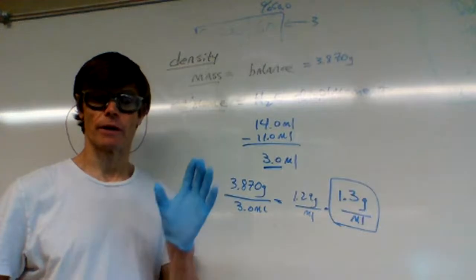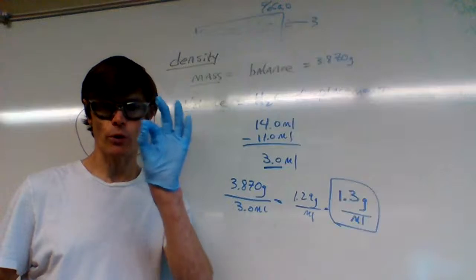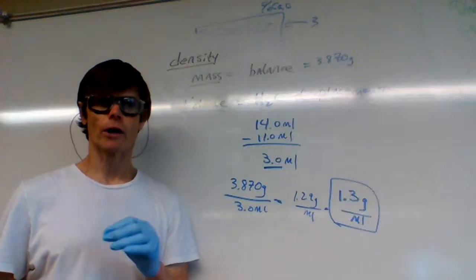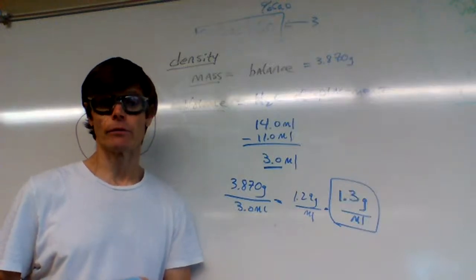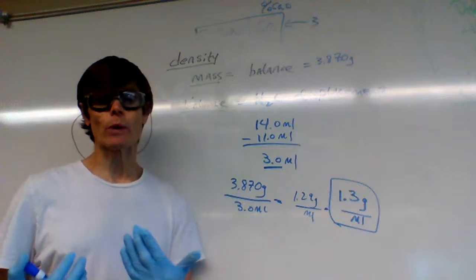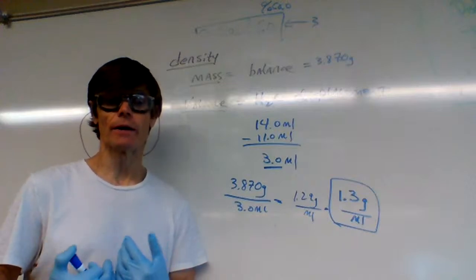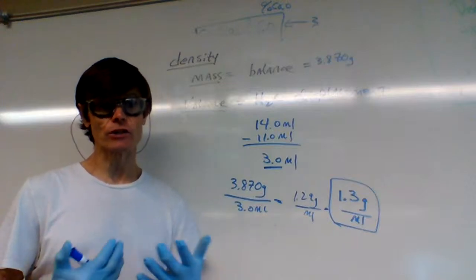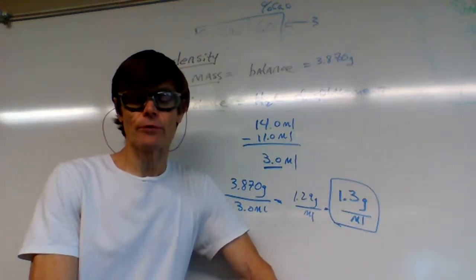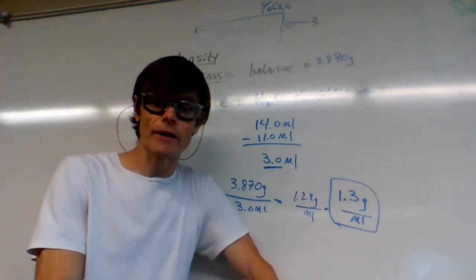Normally, if we're working in a more sophisticated lab setting, you would have your milliliters measured to the hundredths position. The examples that I showed a few minutes ago, those were a little better graduated cylinders. Those would be the ones that you can measure to the hundredths position, not the tenths position. And there are graduated cylinders out there that give that level of precision. So these are just some examples of the types of measurements we make in the lab. It's really a warm-up exercise to learn how to use glassware, how to go through some calculations involving some measurements that you do in the lab. And the exercises that we have for you on the simulation are very similar.